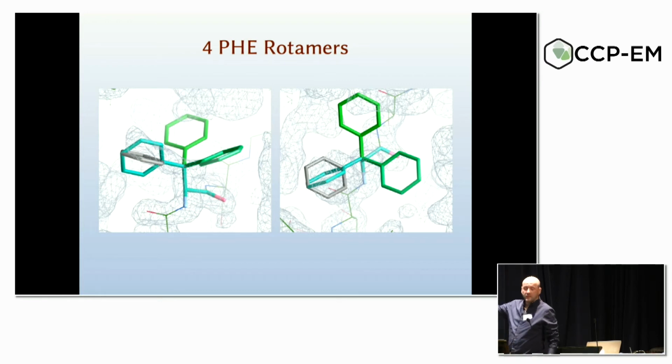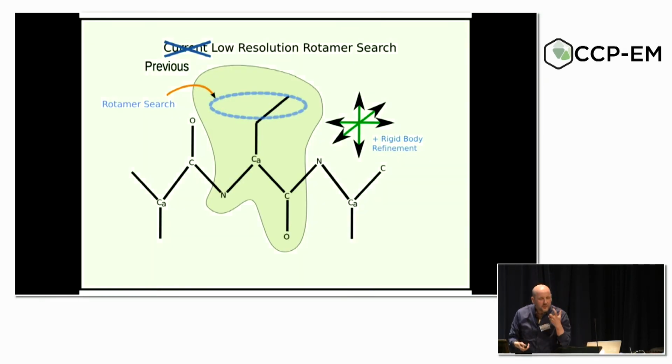They're high probability because they're low energy, and try to add those on to a C alpha, C beta model. Now, we can't just edit the chi-angles because that won't find the correct solution in our model. We need to have another set of hypothesis generation, as well as merely the chi-angles.